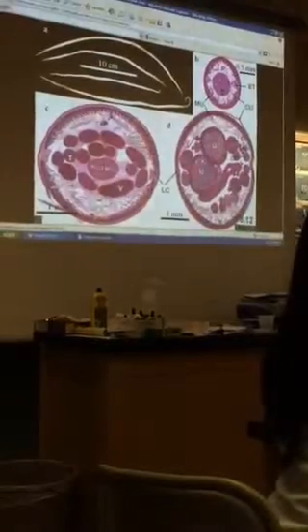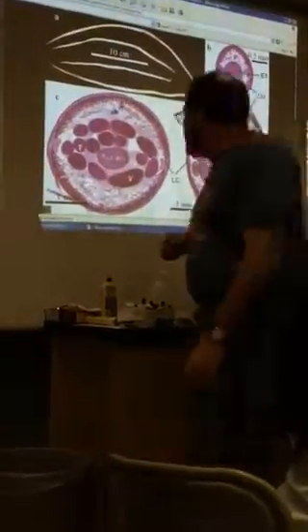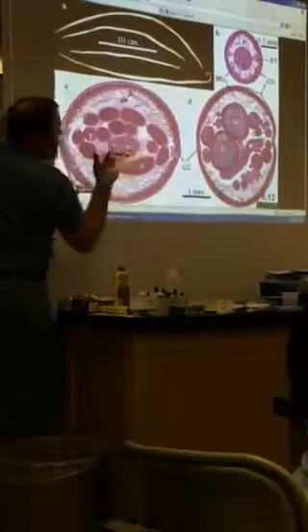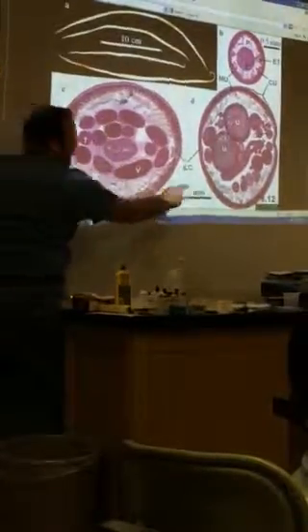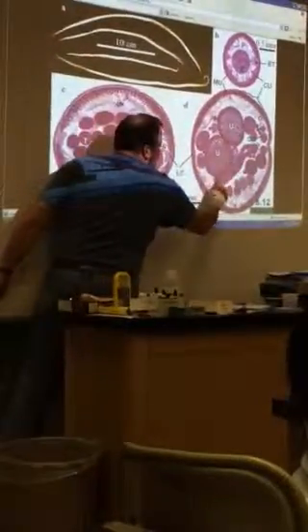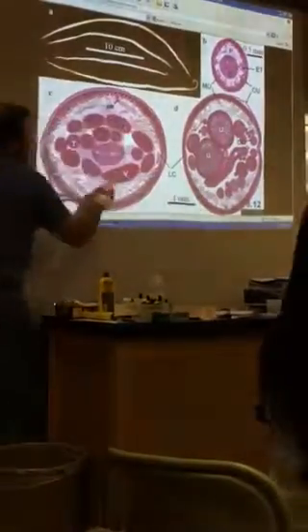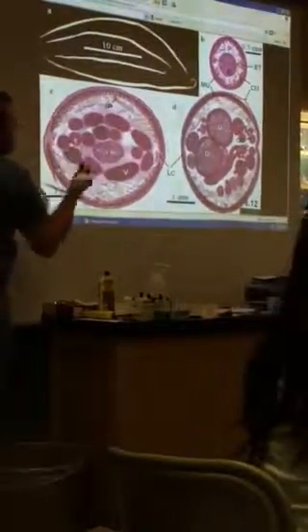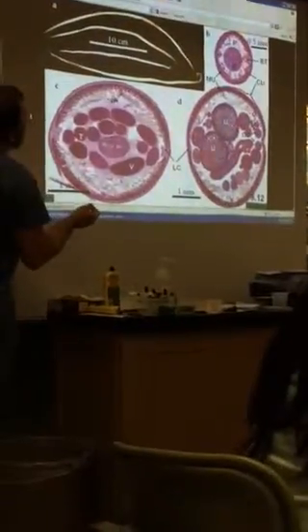This is the male. And most of what you see here is testis. Again, the spaghetti that's going back and forth, and we're sectioning it like that. We get testis. The intestine is often very flat, so it's not hard to tell the intestine. It doesn't even look like a circle. Okay? And the intestine looks a little more like a circle on this one, but it's different from these other parts. We have testis, vas deferens, and seminal vesicle.